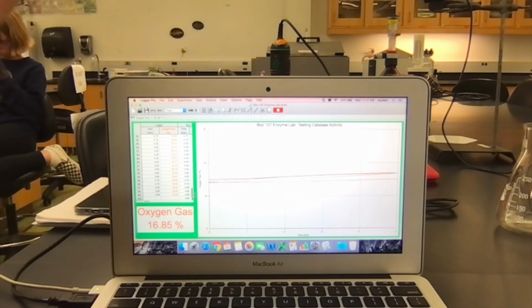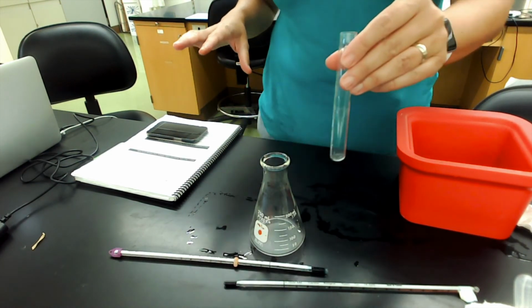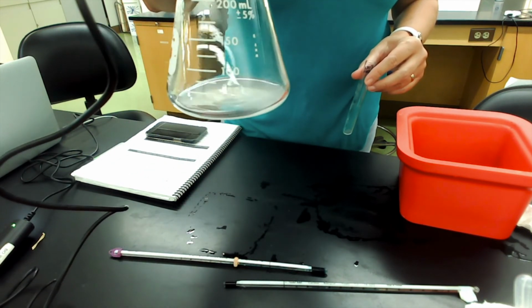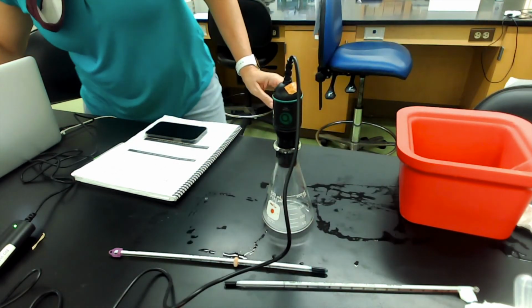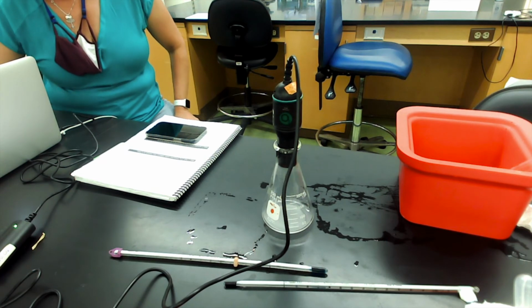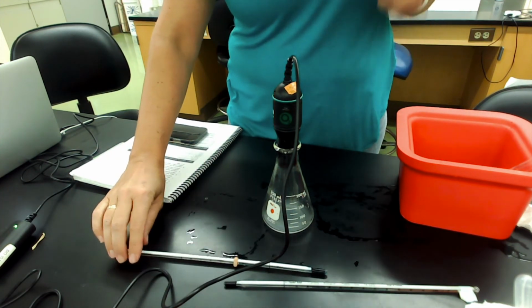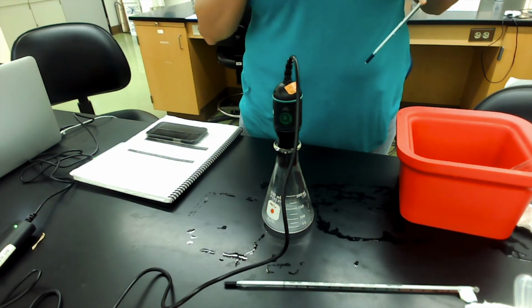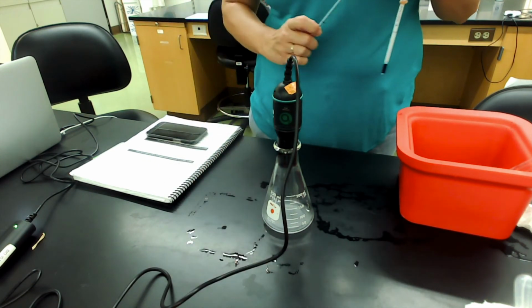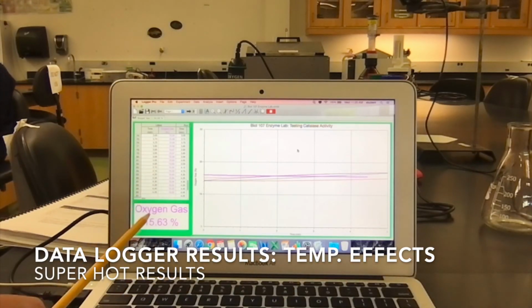And I'm going to add one extra run for an extra boiling hot sample. This is a sample I put together from buffer that I put in almost boiling water to equilibrate. Then I added the enzyme, and you can see it looks cloudy. It's not very bubbly. I'm doing this sample because one of the interesting things about enzymes is that as you raise the temperature of the system, you generally expect to see an increase in product production. However, when it gets really hot, like in this case up to 95 degrees Celsius, that's way too hot for most enzymes. And so instead of seeing a huge increase in production of O2, we might not see much O2 at all.